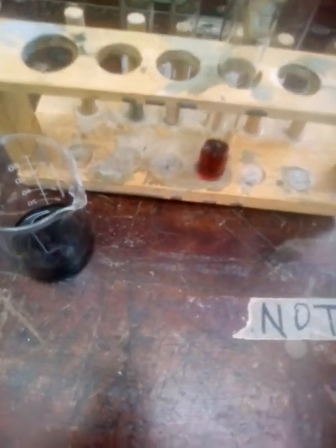And we are also certain that oxygen was liberated because we saw the bubbles or the effervescence that were given off in the test tube. So this reaction was successful. Remember that this was a reaction between potassium iodide and hydrogen peroxide in an acidic environment. This is the end result of our reaction, and our reaction was successful today.